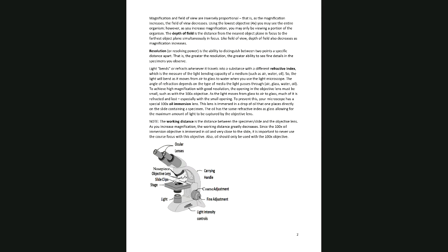So as you change the lenses, the distance between the lens and the slide gets smaller and smaller. And that's why I use the coarse focus on low magnification and the fine focus on high magnification. That way you won't break the slide.